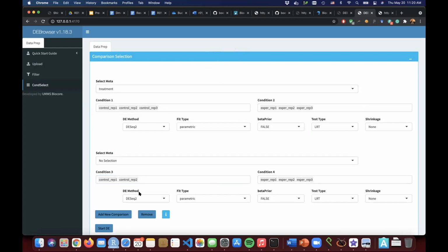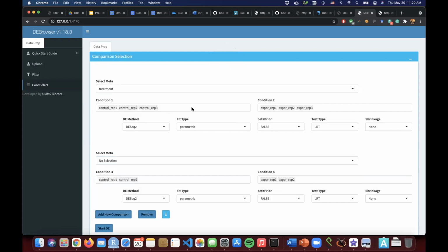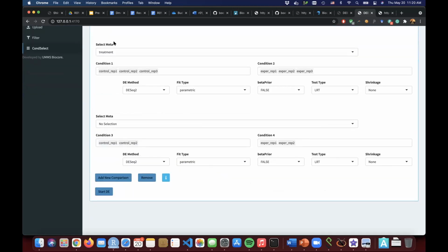In the second comparison, I want to compare 2 replicas versus 3 replicas. I want to show you why more replicas help you better while you're doing your analysis than 2 replicas. This will also tell you. But also you can change the DESeq method, edgeR or limma. If you have, for example, microarray, microarrays are already normalized counts. So you cannot use DESeq2, we are using limma, for example, for microarrays.